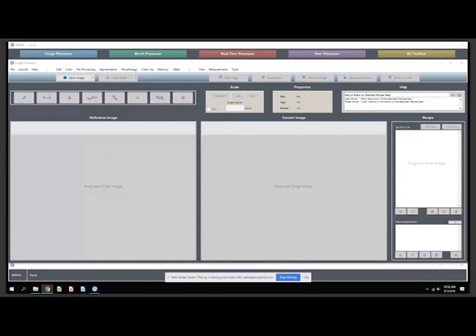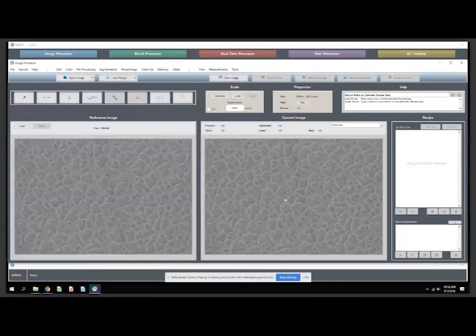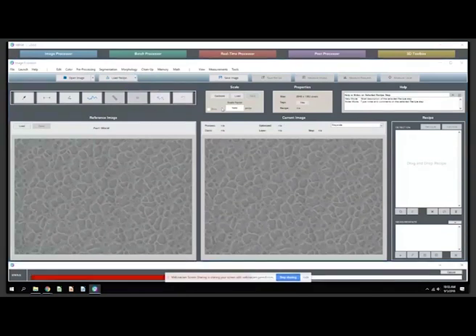So to open an image in MIPAR, it's very simple. You just drag one in. Here is one of the gamma prime images that we worked with NASA on. And to load the recipe that we have created, you can use our new recents menu here next to the load recipe button. It remembers the last several recipes that you've loaded in, so it really becomes your personal integrated recipe library, where with just 2 clicks, you're running now this algorithm. So you see it running through the various stages down here.